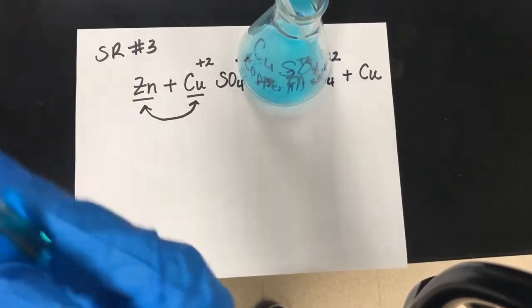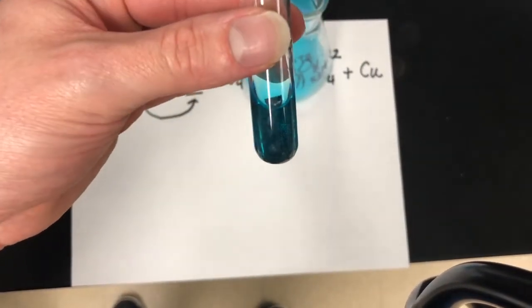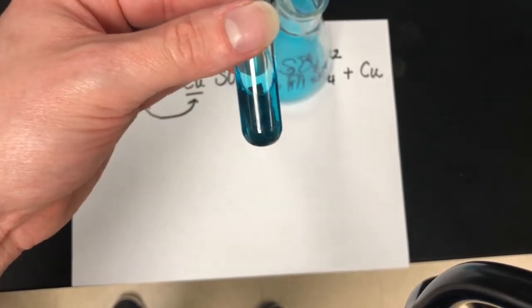Doesn't want to change. There we go. Here we got a good view. So you see the copper? It's all plating out. Okay, so this is going to be single replacement reaction number 4.